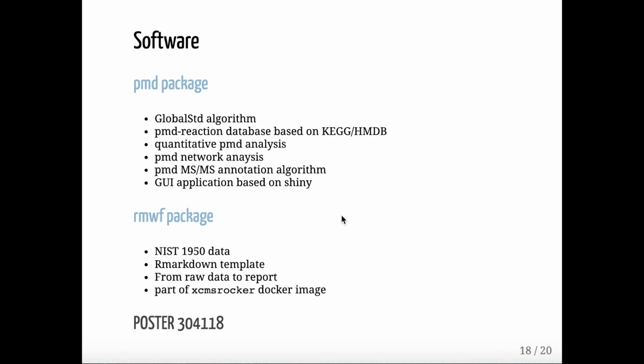It also has a PMD reaction database based on KEGG and HMDB. You can also perform quantitative PMD analysis and network analysis with this package. And also, I didn't mention it here, but you can do MS-MS annotation based on PMDs. If you are interested, you can check our poster at the list here.